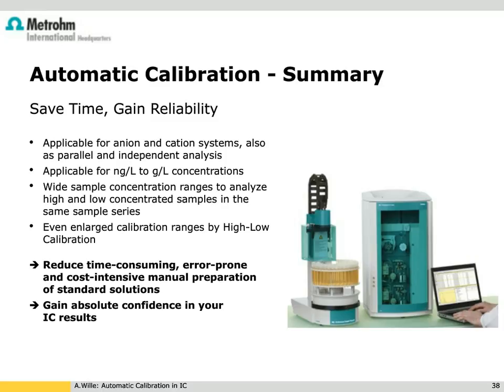Another question came in from David, and this is for Andrea. Would the automatic calibration work with a hyphenated ion chromatography MS system? I think it would work. The ion chromatography part in such a combination is like a sample preparation part. We only separate the samples in the IC part, and how you enter the sample to this IC part doesn't matter. So it can also be this automatic calibration. No issue with that.